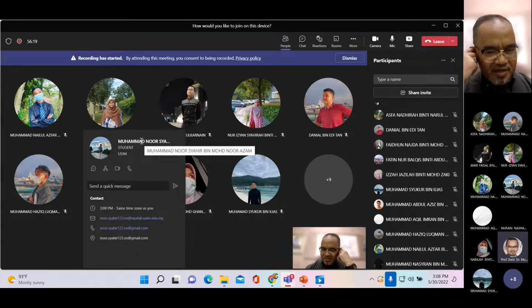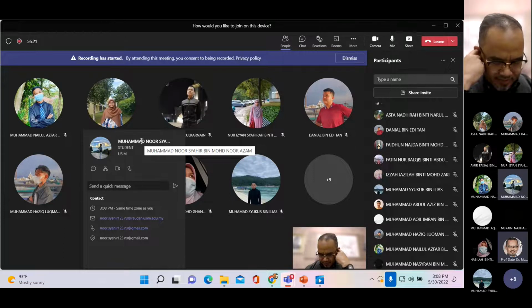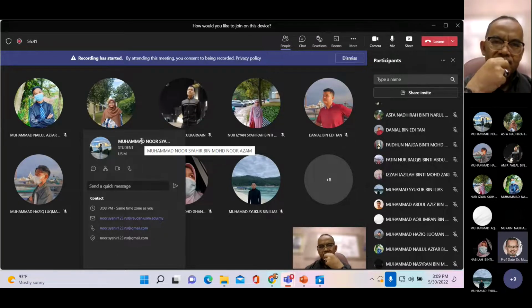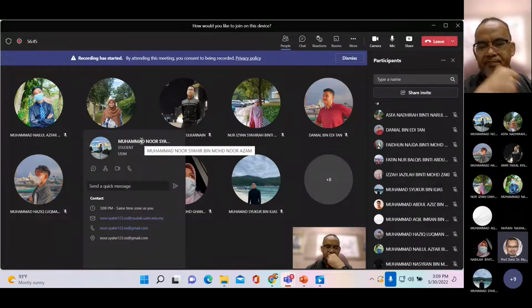The sample will absorb the light. Then it will emit the light, giving the wavelength. That's like fluorescence. Fluorescence gives the light back. If it is absorption, it doesn't give light back.